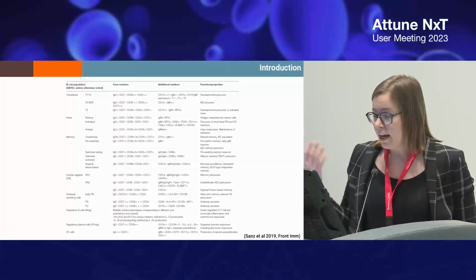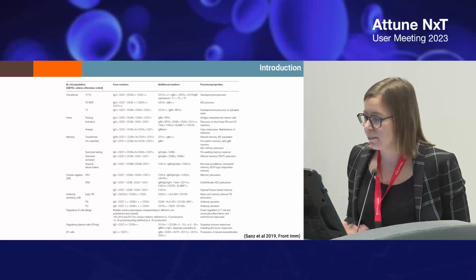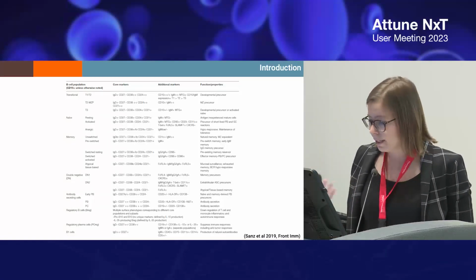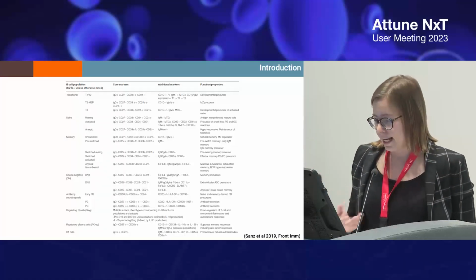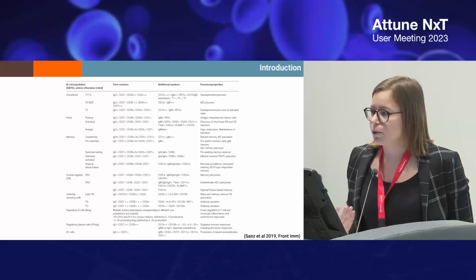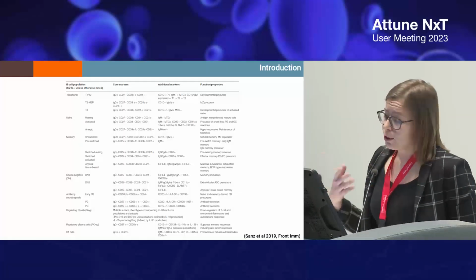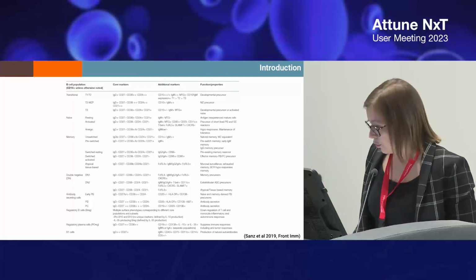You can see that there are a lot of B cell subsets. For example, we have 3 types of transitional immature cell subset. We can differentiate naive B cells into resting, activated, and anergic. We have a lot of types of memory B cells, but we also have some atypical subsets of B cells, such as the double negative B cells and the regulatory B cells. We have to mention the age-associated B cells. So there is an increased need to define and correctly characterize every B cell subset, also because every subset represents a different stage of differentiation and has a different function.